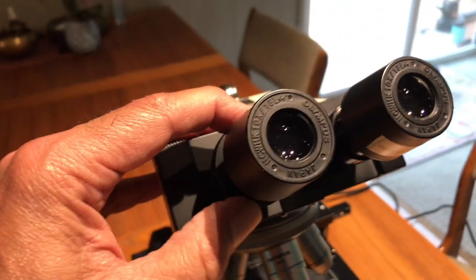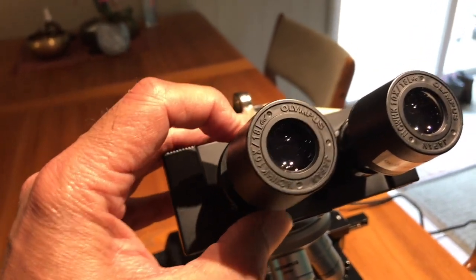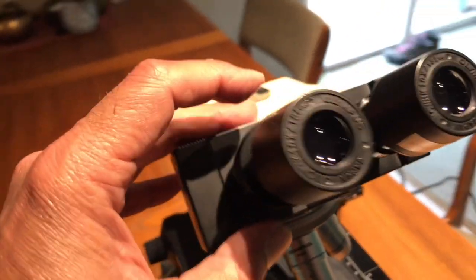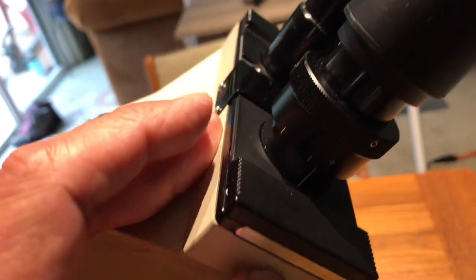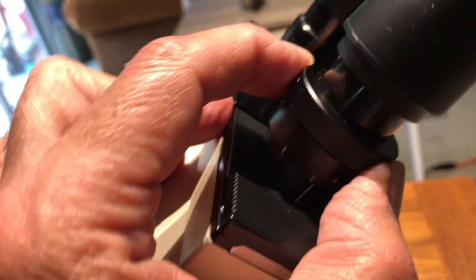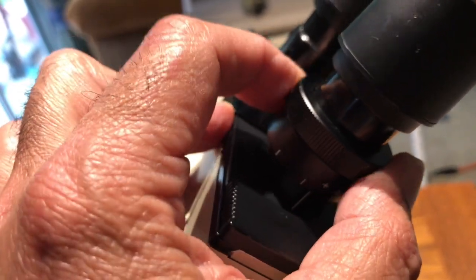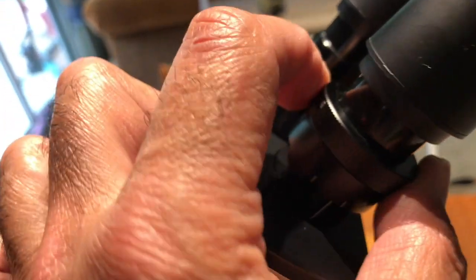The way you use it, there is a dial on the eyepiece that you can turn clockwise or counterclockwise until you get the image, when you're looking through the eyepiece, until the image looks clear to you.